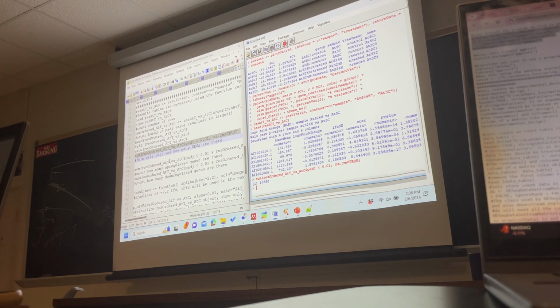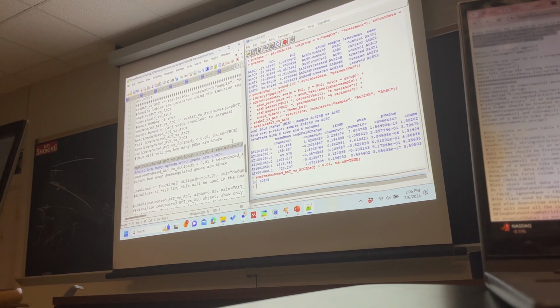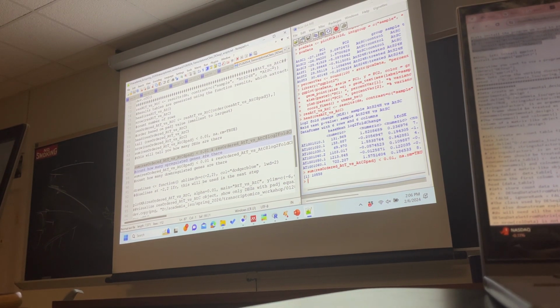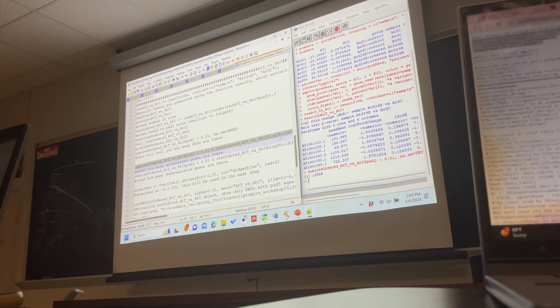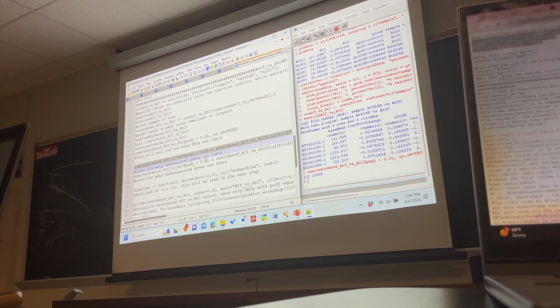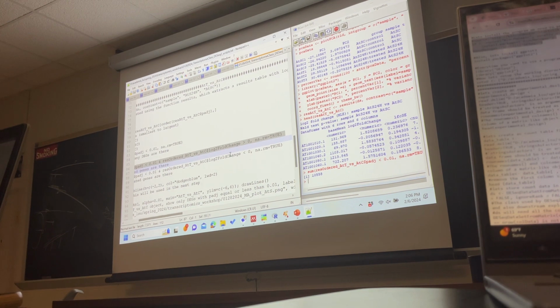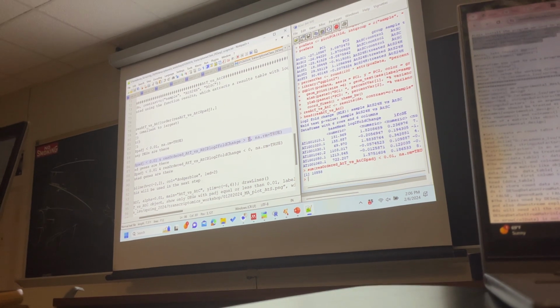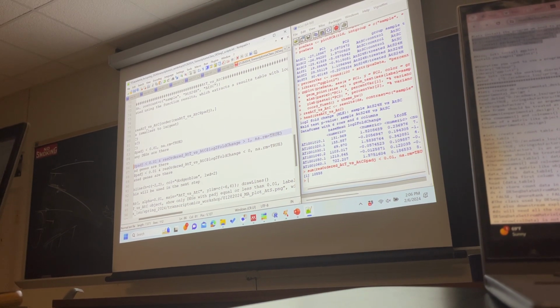So there is some code here that you can use to account for this p-value and also the log2 fold change. If the p-value is less than 0.01, and then the log2 fold change is, you see here, I didn't put any cutoff here. If you say greater than 1, then you will get a smaller number of differentially expressed genes.